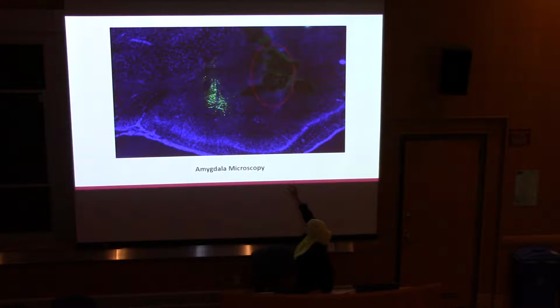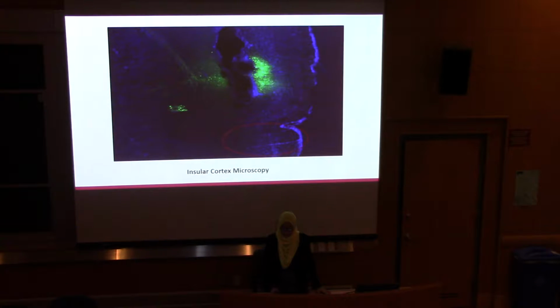Why it's important for that to happen is because, remember how I said the LED light shines down through the cannula from the optical fiber? That LED light allows the GCaMP neurons to activate and send back that green light into the machinery, and allows us to see what the neurons are doing. But in this case, we weren't able to see anything, which makes sense since the virus is not under the cannula.